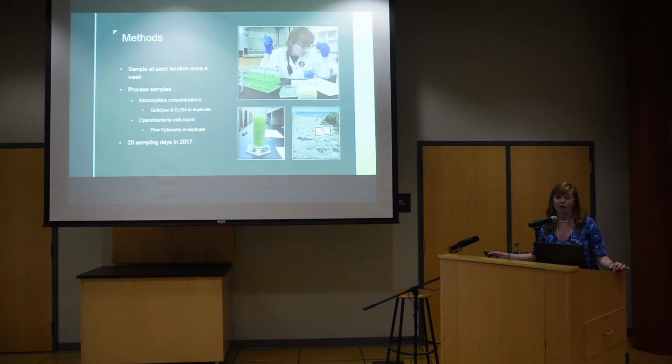All of our samples were processed within 24 to 48 hours, depending on what staff we had and how much time we had at the end of the day. I mentioned that we did the quick lyse. We did each quick lyse sample in duplicate, and then we did our cell counts for cyanobacteria in duplicate as well. And we had 20 total sampling days.